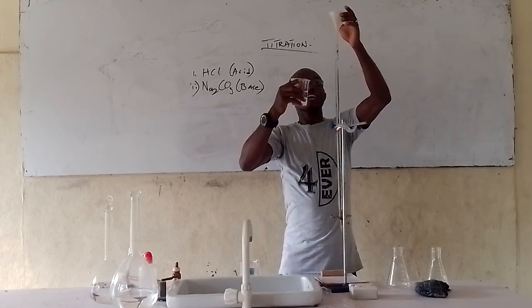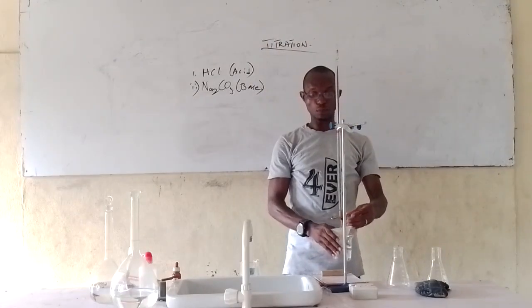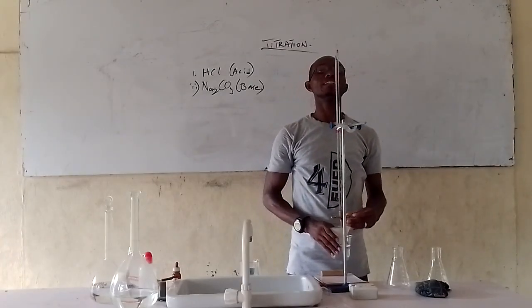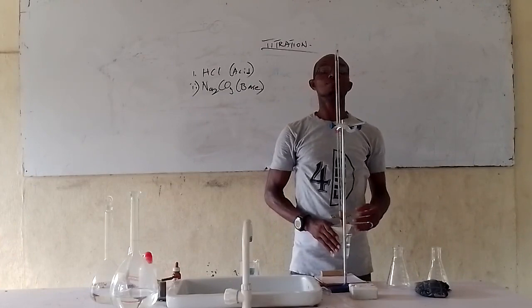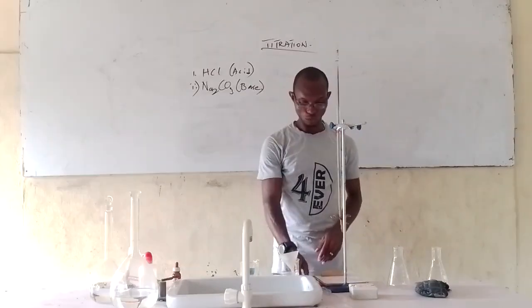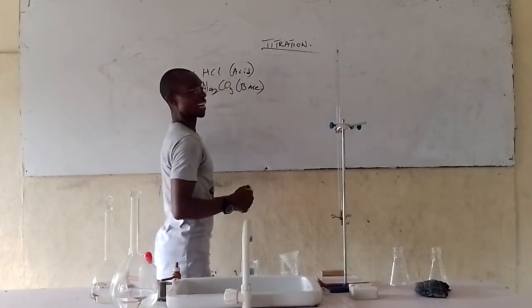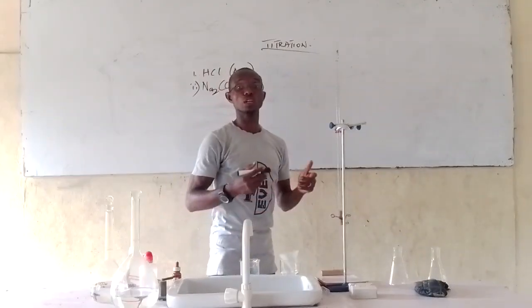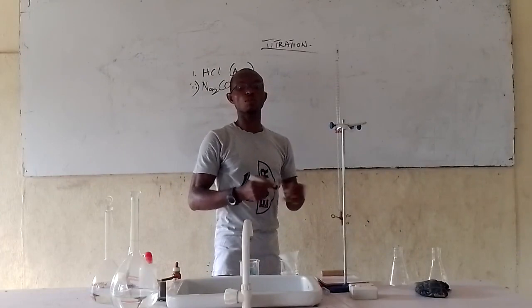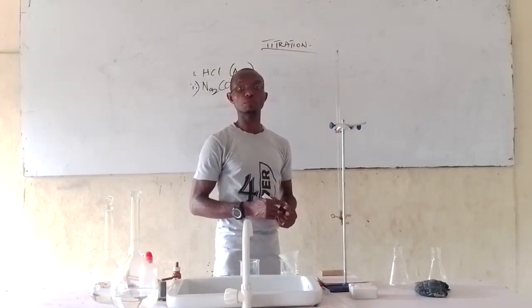So I have filled the burette beyond the graduated point. So I will gradually dispense the content of the burette so that the liquid in it has its mark sitting directly on the graduated mark. When we talk about titration, there are some errors that students fail to take note of, and these errors are responsible for some of the difficulties they eventually come across during the practical.